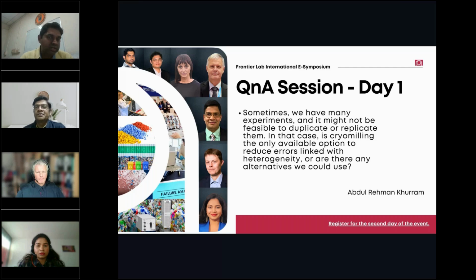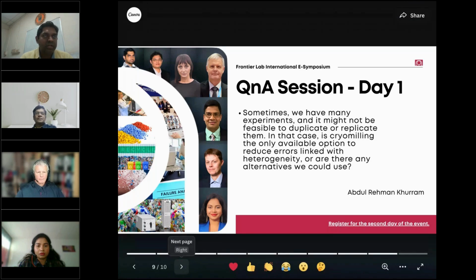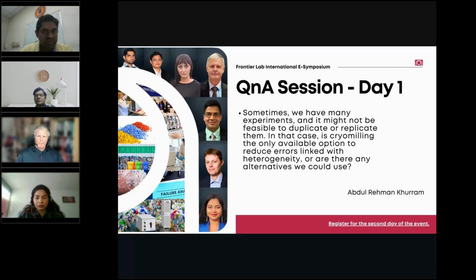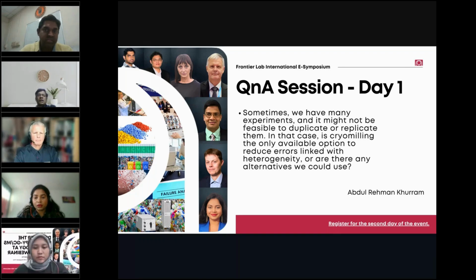I would also like to add that for samples that are more organic in nature with very little inorganic content, cryomilling will certainly help to give you repeatable results. You can always duplicate it for one sample and verify, and if it is okay, then simply go ahead with it. But for heterogeneous samples, like the biomass question asked earlier, even with cryomilling, one has to verify and run a few runs to check how homogeneous the sample is. As Karthik said, based on experience you can cut down on the number of experiments with PyroGCMS. Typically we do multiple experiments, understand the standard error around the individual compounds, and later try to minimize the number of repetitions.